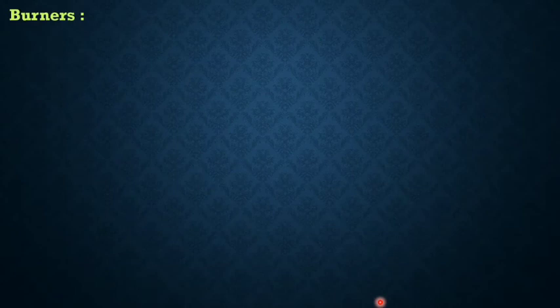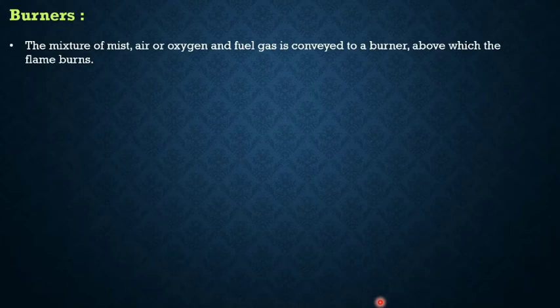The next point is the burners. Generally, there are 4 types of burners used in flame photometry. We will see this one by one.